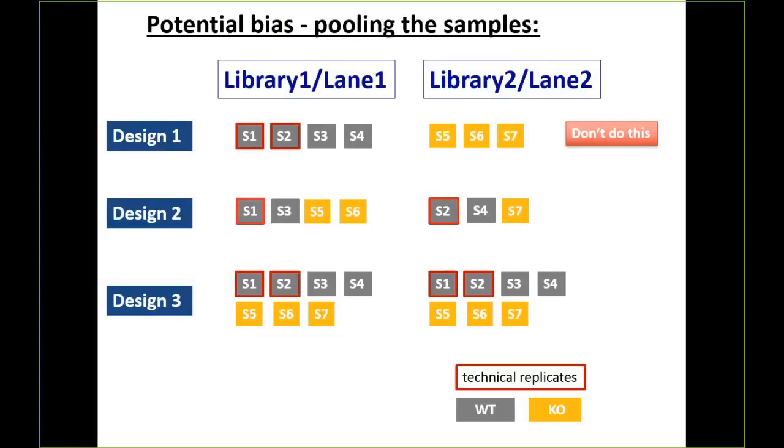So at the very least, I'll be able to say, hey, there's some unexplainable differences between the technical replicates. This shouldn't exist. There's something wrong with one of these lanes. I may not be able to say which one. And I may have to come back and say, well, sample 1 and sample 2 should have been the same. They were actually very different. I may not know how to quantify Illumina technician sneeze and its effect on sequencing, but I'll know that something was there.